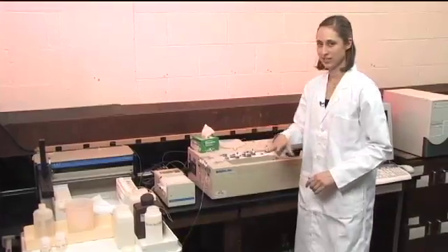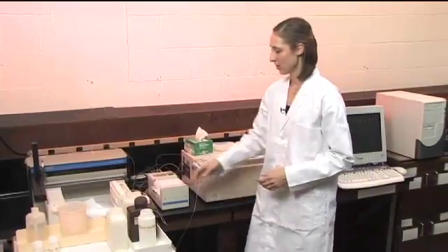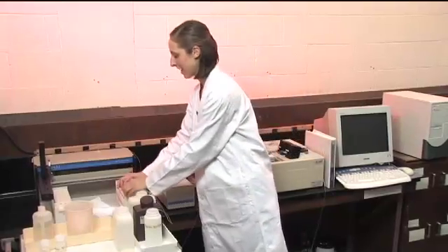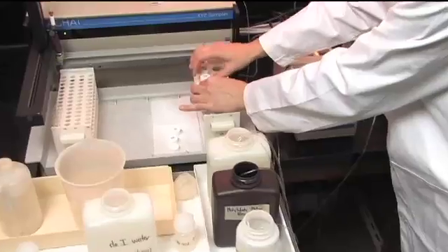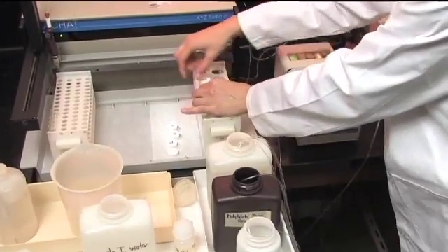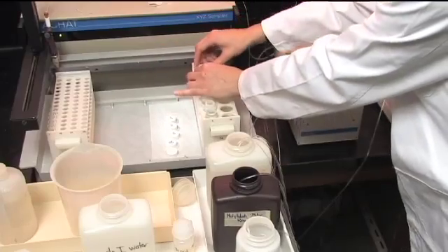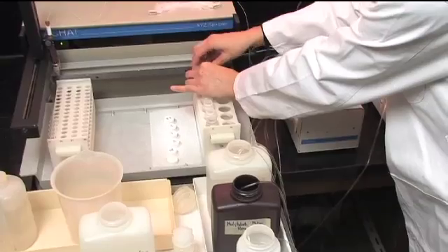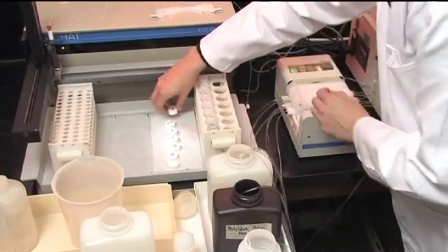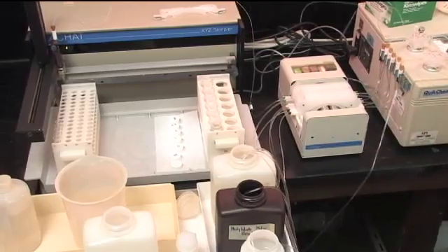That takes a few minutes to equilibrate through the system before you're ready to actually start your run. While waiting, I'll take the caps off of my standards. The other things you need to prepare are to make sure that your samples are all inputted into your program, that you have the correct method open in the computer program, and that it will be ready to run.